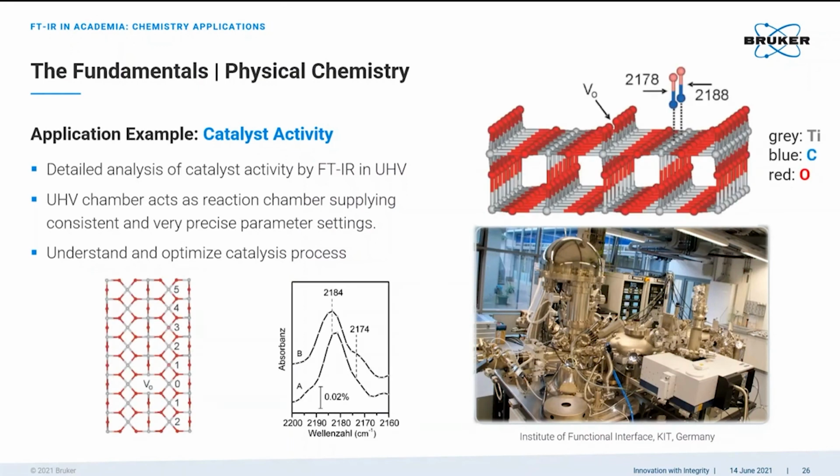In the example shown here, the surface catalyzed formation of formaldehyde has been considered, especially the CO adsorption onto the titanium oxide catalyst surface, which is an essential step of the surface catalysis. A catalyzed reaction has been checked in detail. I want to point out we are measuring in reflection mode the adsorbed CO molecule with sub-monolayer surface coverage, and the absorption band appearing at 2174 wave number with intensity of about 10 to the power of -5 AU evidenced the adsorbed CO species.